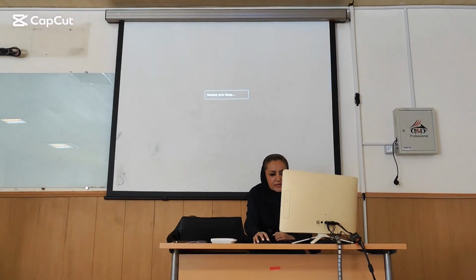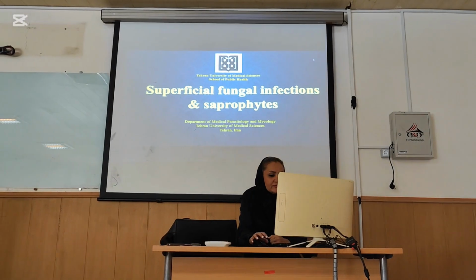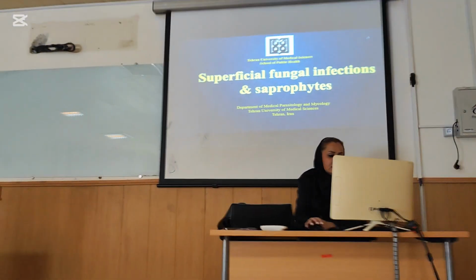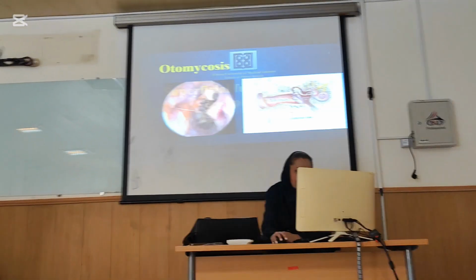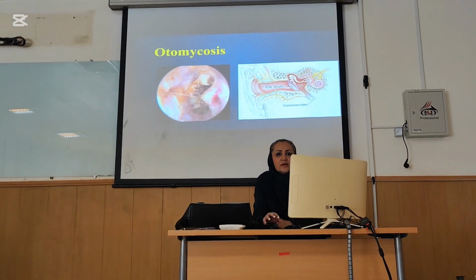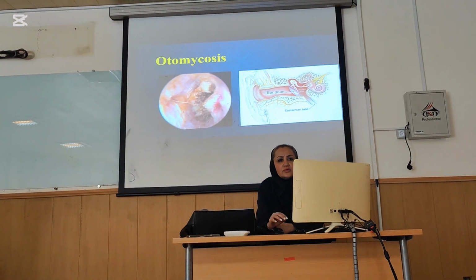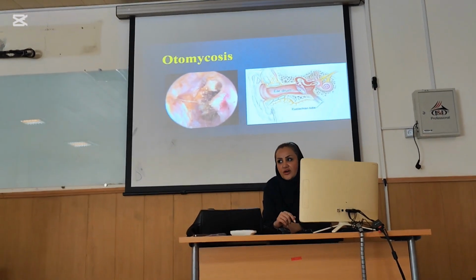For you, including superficial fungal infection and saprophytic fungi. At first, we have otomycosis. The causative agents for this disease are molds, yeasts, and dermatophytes.